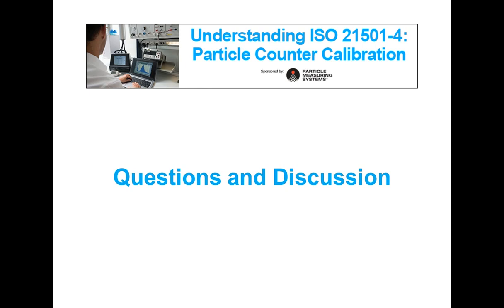Okay, thank you. And we have another question here. Is particle counter calibration a "must"? The word must is in quotation marks. So I turn that over to you, Daniele.